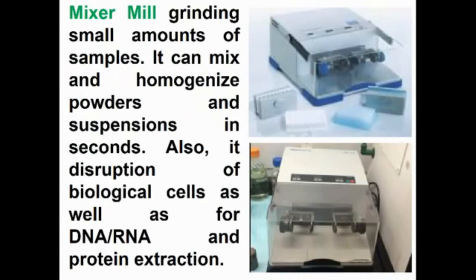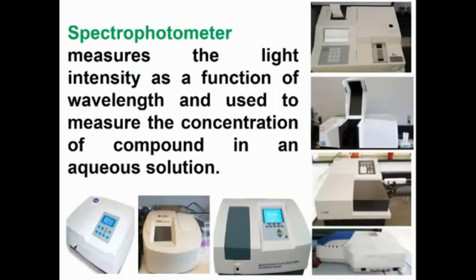It can mix and homogenize powders and suspensions in seconds. Also, it is used for disruption of biological cells as well as for DNA, RNA and protein extraction.